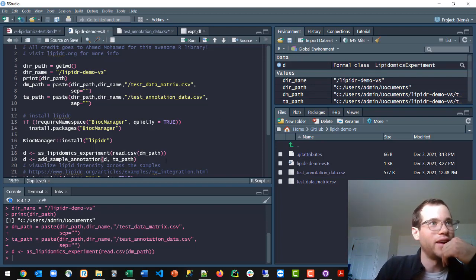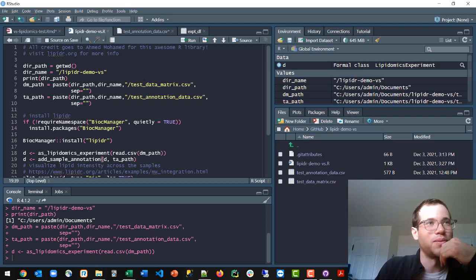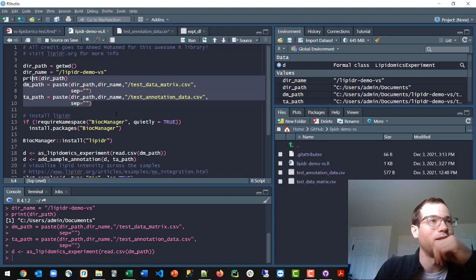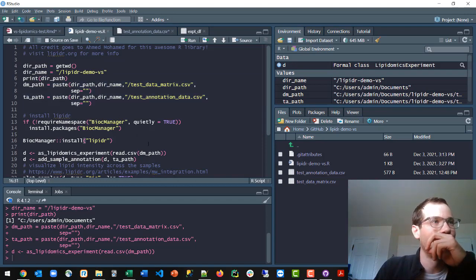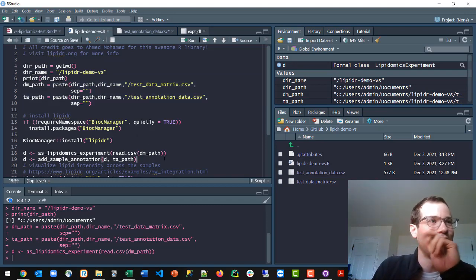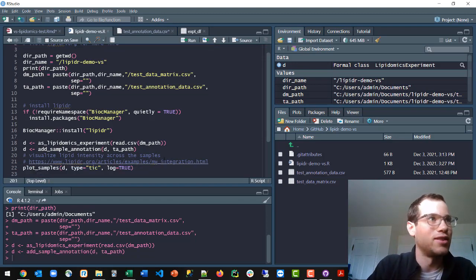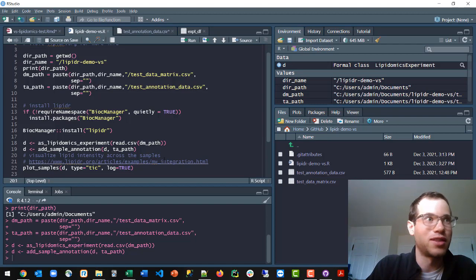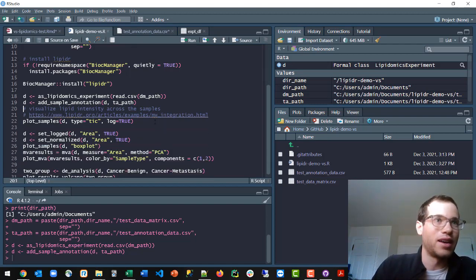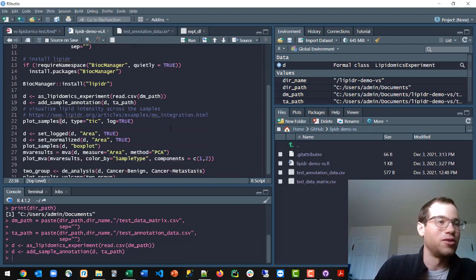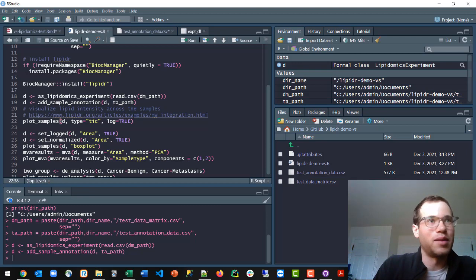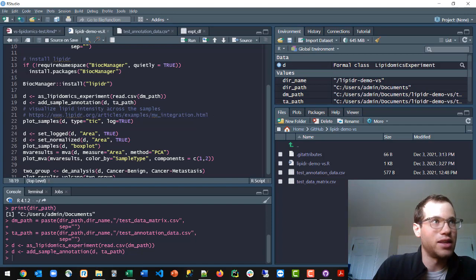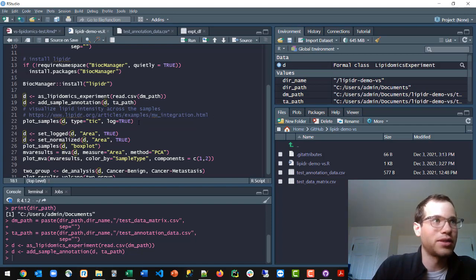And then, so my issue is I didn't actually run these lines. So that's one thing I keep messing up when I'm writing R is just I don't actually run the lines. I'm just writing Python. But anyway, and then we're going to run this guy just like that. I hit Control-Enter on the keyboard to run just that one line. And now we can actually do some cool stuff. So we've got both of our CSVs in this D object that LipidR has created for us.